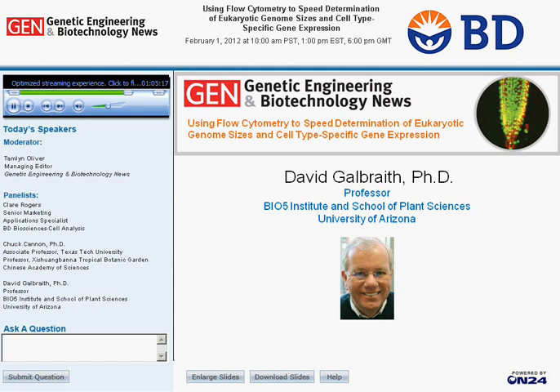Okay, and then you measured all species simultaneously? We chopped separately and mixed and then measured them all together. In principle, you can mix them together and chop. And in fact, people often use this as a ploidy screening tool. For example, if you're looking for a minor population of triploids in an overall population of diploids, you can take, say, 100 seedlings and chop them all together and then look for the triploid peak in the background of the diploids. And so you can make samples and chop them simultaneously.